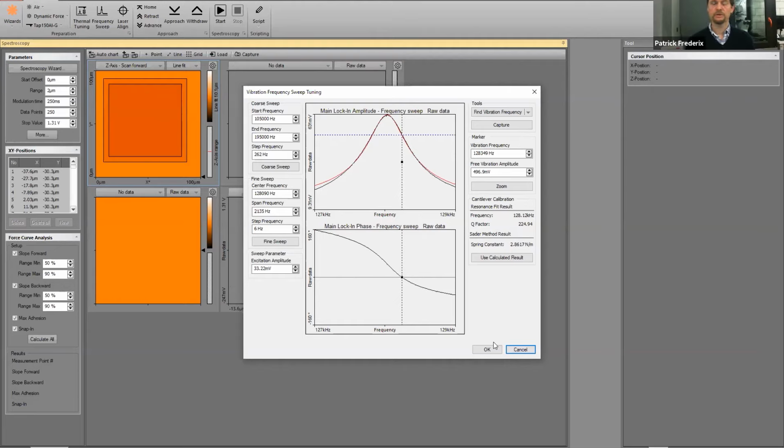The force curve measurement in itself is the same, whether it's measured with FlexAxiom, FlexBio, or FlexANA. That's all the same measurement protocol that is followed. And the FlexANA offline is just an analysis program and independent of which system you recorded the measurement with. So it can also be measurements done with an IOAFM. You can still process the data with the ANA offline software. And I hope that answered that.